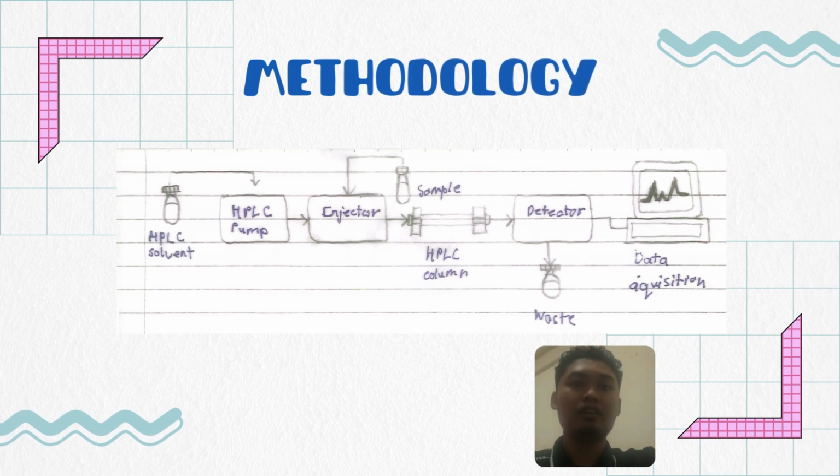Methodology. Fill the mobile phase reservoir with the prepared HPLC solvent. In this case, we use water. Ensure the solvent is HPLC grade to avoid contamination. Degas the solvent using ultrasonication or helium sparging to remove air bubbles. Set the flow rate on the HPLC pump to 1 ml per minute. Prime the pump to remove any air trapped in the system. Monitor the pressure to ensure system stability.